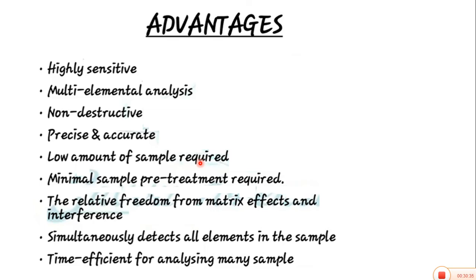Minimal sample pre-treatment is required, there is relative freedom from matrix effects and interferences, it can simultaneously detect all elements in the sample, and it is time efficient for analyzing many samples. So it is definitely time efficient for the analysis of different sample materials.